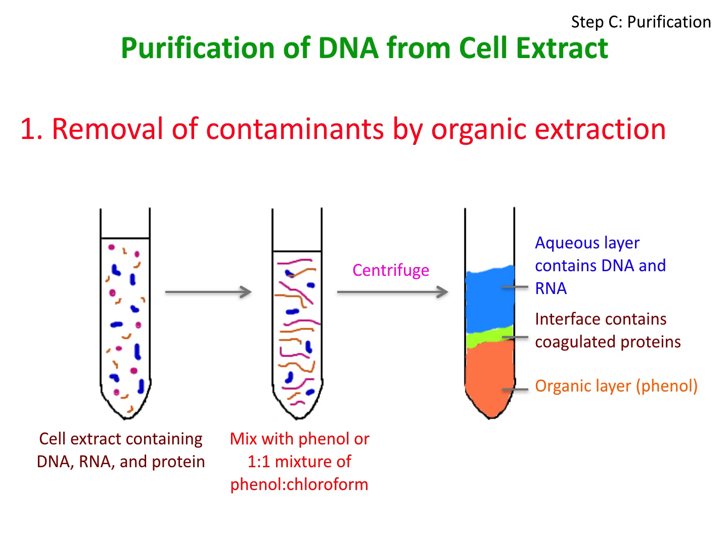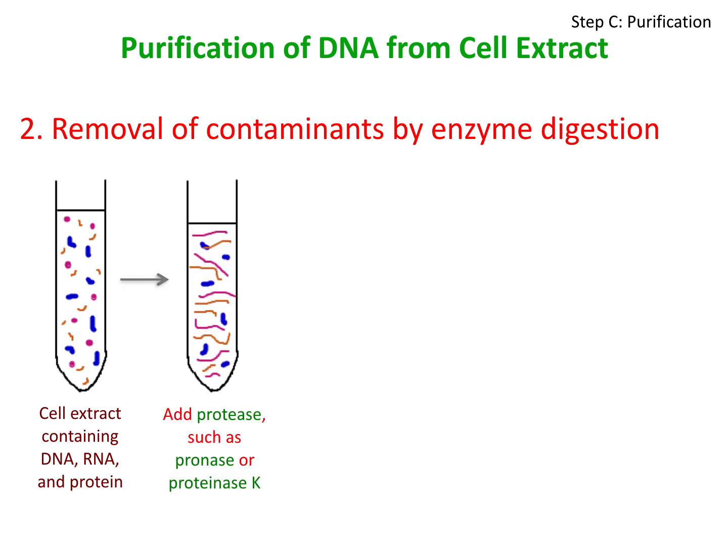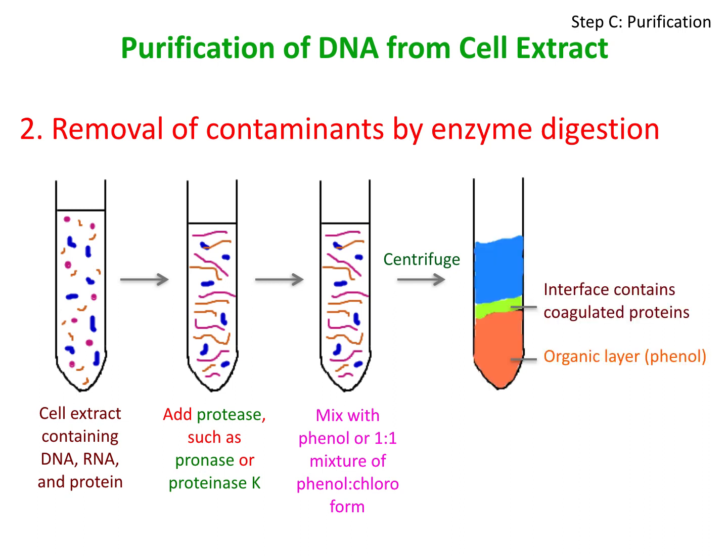So at this point, a question arises: how to remove this protein contamination? The answer to this question is enzyme digestion. Prior to phenol extraction, a protease like pronase or proteinase K is added to the cell extract. The protease breaks down the polypeptides into smaller fragments. Now, once you add phenol and centrifuge the mixture, these fragmented peptides very easily settle down at the interface. And the aqueous solution contains both the nucleic acids, DNA and RNA.